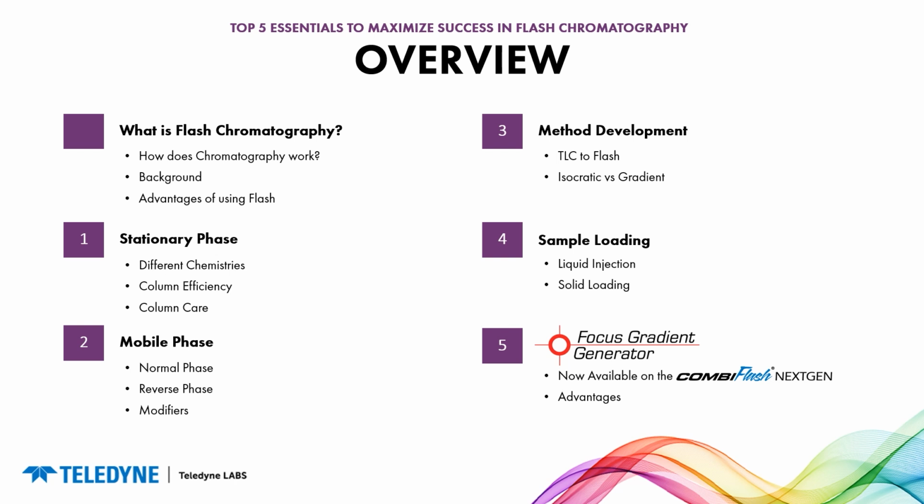We'll talk about sample loading, liquid versus solid loading, the benefits for each of those. Then lastly, we're going to talk about the focus gradient generator, which is now available on our Combi Flash Next Gen units. I'm going to tell you how to use it and why you should be using it.